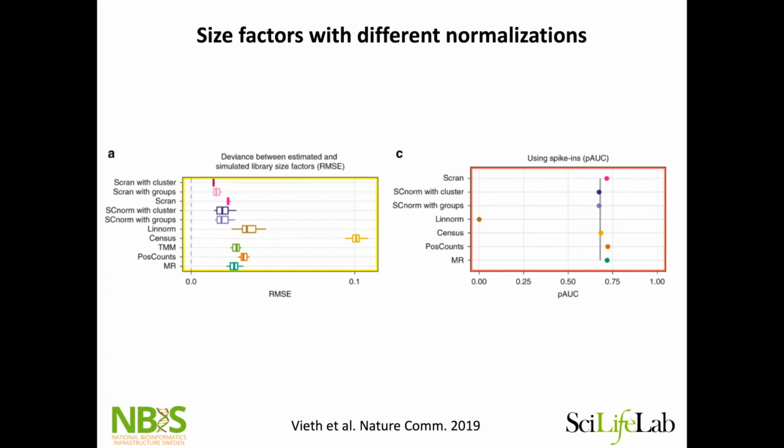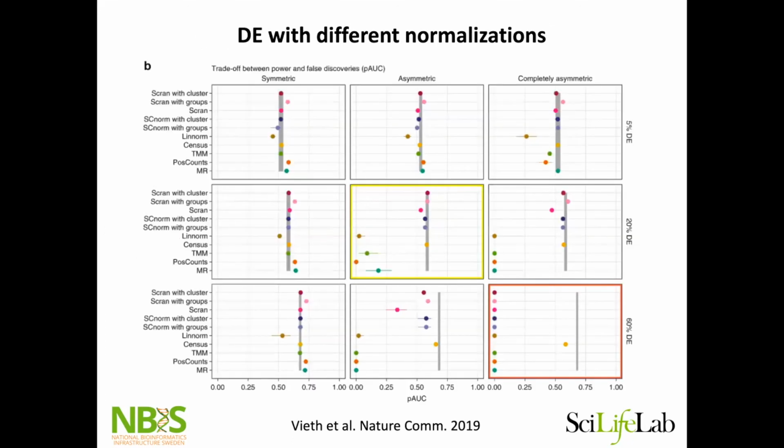But what's more important is that, also in this paper and in my experience, what normalization you do doesn't have a big impact on clustering, dimensionality reduction, and so on. But it has a big impact on differential expression.